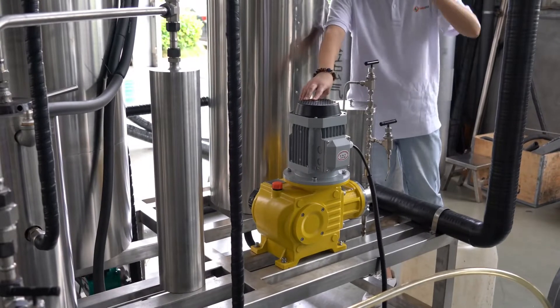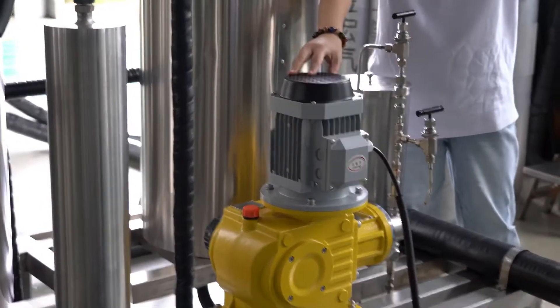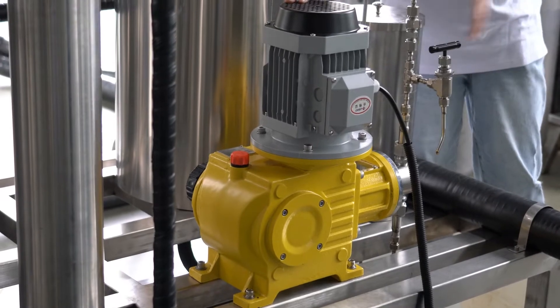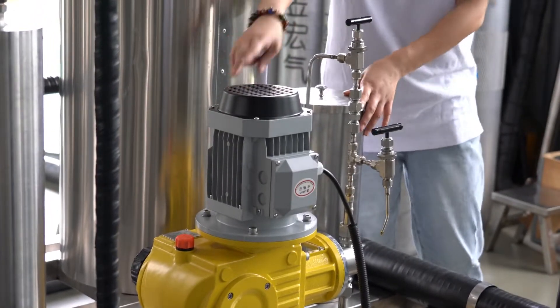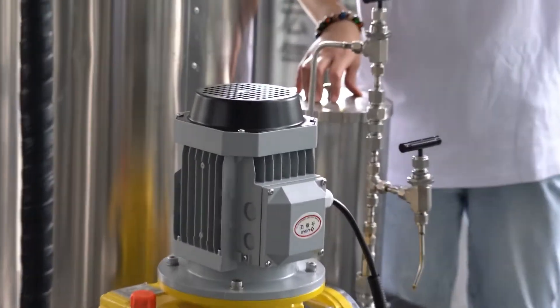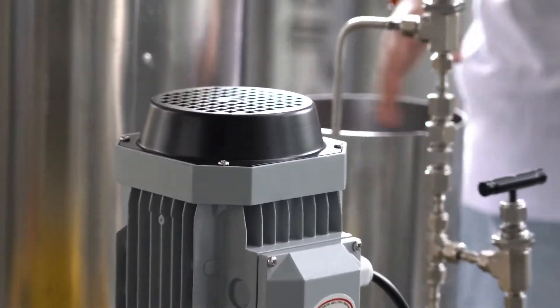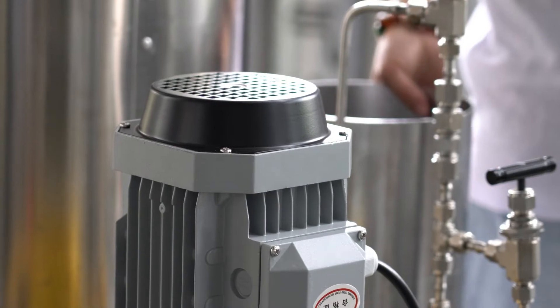This yellow pump is a co-solvent pump, also called the auxiliary pump. It can transport solvent into the system. The tank to the right of the yellow co-solvent pump is a co-solvent tank, into which the co-solvent is transported.